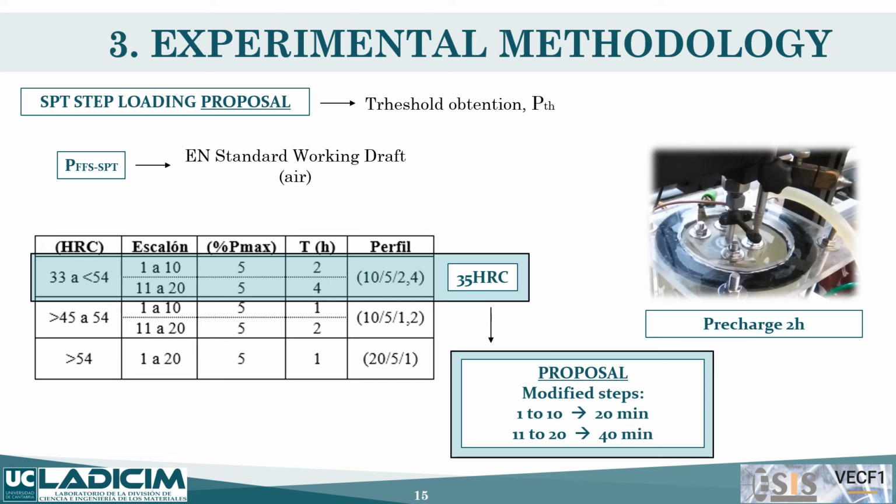First, prior to the mechanical testing, a pre-charge in the environment of 2 hours is proposed instead of 24 hours, because of the specimen thickness.